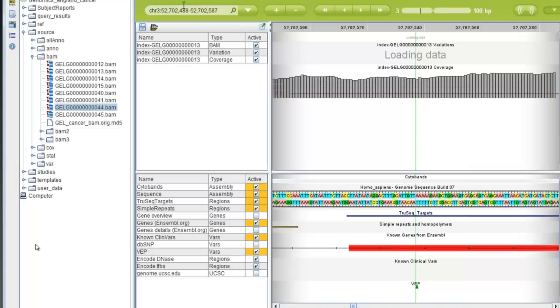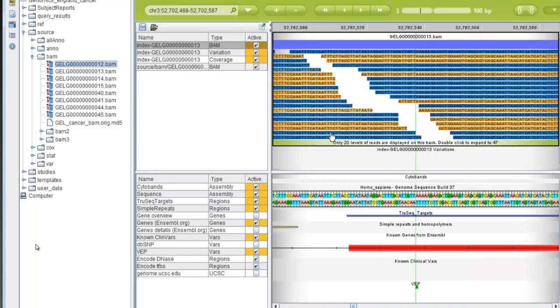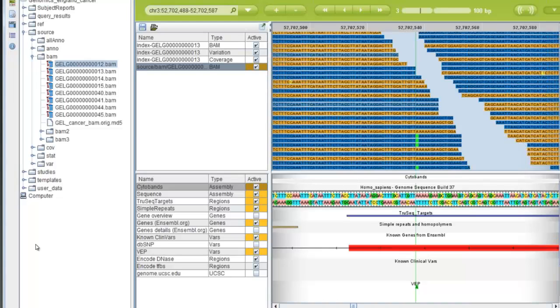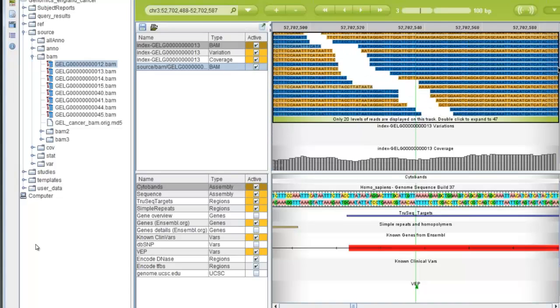Okay, this is opening it in the normal sample. We've got to drag over the BAM file for the tumor sample as well. At this point, you need to have, of course, BAM open in the file browser. So in green, you can see the deletion in this tumor sample, and we can double-click to see it in all the reads. This is clearly a high-quality variant, so we can confirm this in the tumor sample.